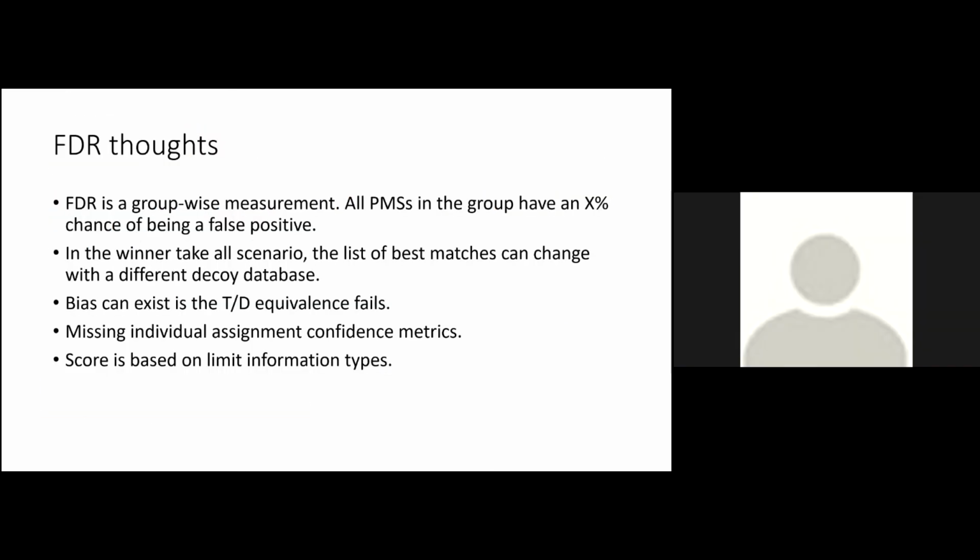Sorry, Michael. Yeah, here. So I thought the decoy was actually computed on the sample specific measurements that you have. So apparently it's kind of taken from an available database that is always there, right?